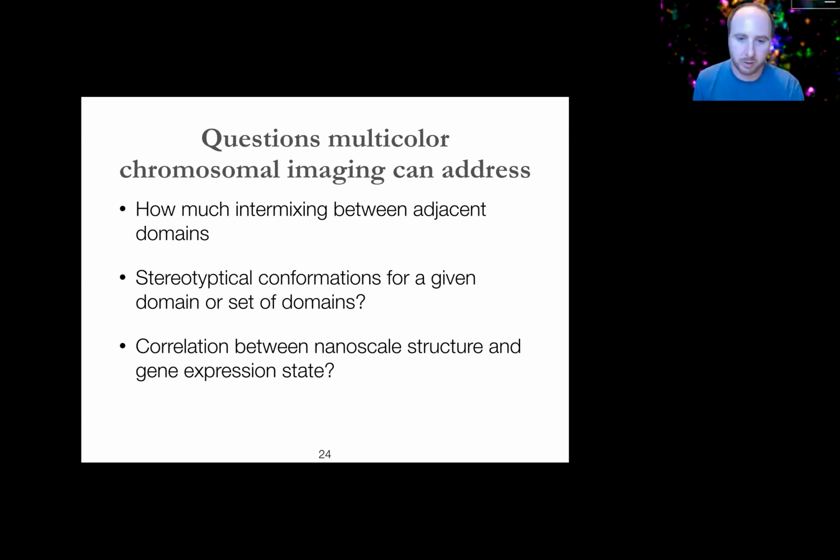So I think we're still a little bit early in getting a sense for that. But I think these kind of approaches, with the resolution they provide, will be great tools to look at that heterogeneity in terms of the structure. And I think one of the big ones that you're starting to see more of come out, including work that just came out from Stephen Wong's lab, is looking at correlations between structure and gene expression state. And this is, I think, going to be the next wave, and in some ways why this section could still connect reasonably well to the spatial omics world.